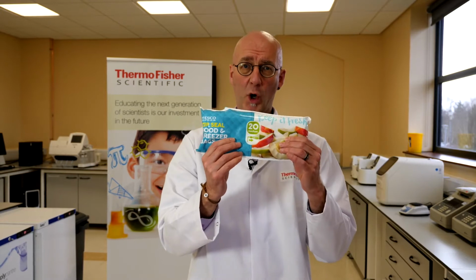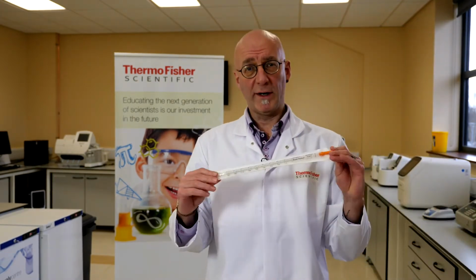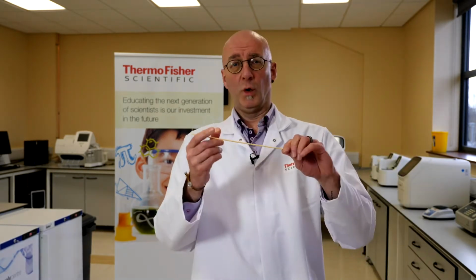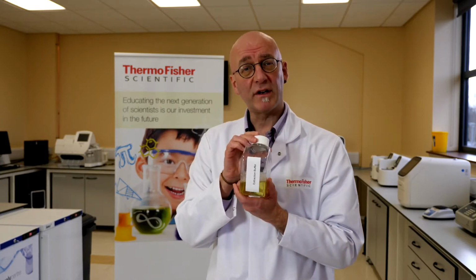Today we're going to be extracting DNA from strawberries. So let's see what's inside our box. Our Ziploc bags, the all-important strawberry, our cold ethanol. We have our kitchen roll. Then we have what we call a pipette. This is known as a pipette bulb. Now the pipette bulb is used for sucking up and releasing the solution from the pipette. Next we have our extraction tube, our funnel. We have a skewer. The skewer is going to be used right at the very end. And finally, we have our extraction buffer.